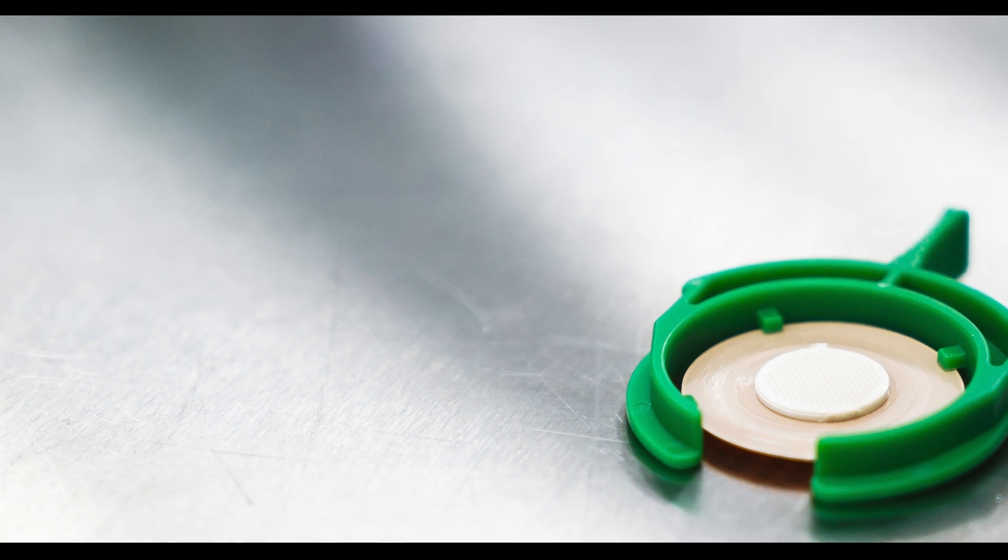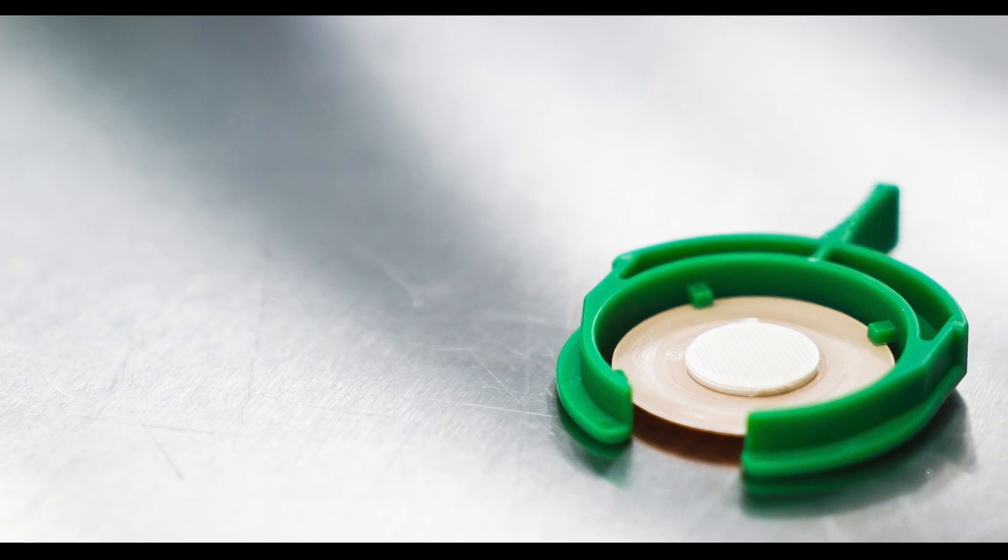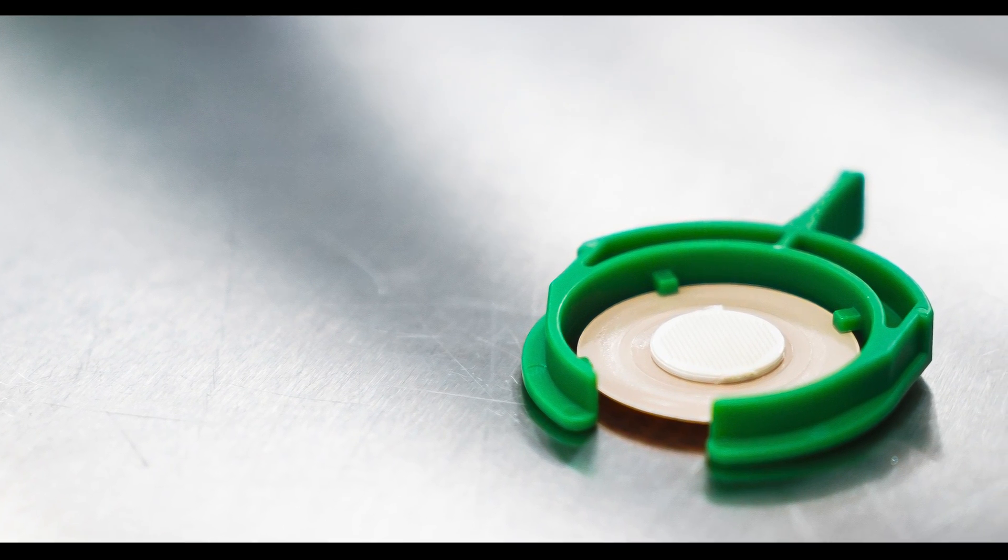The SMTS device is a microstructured patch that is applied to the patient for delivery of that specific drug.